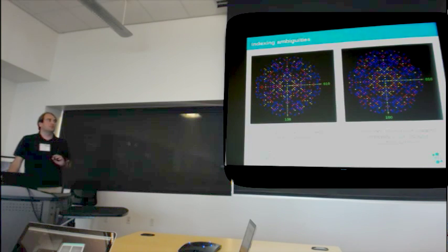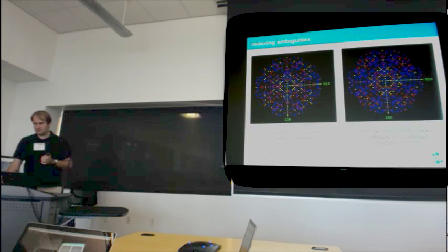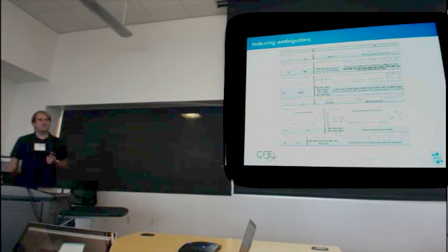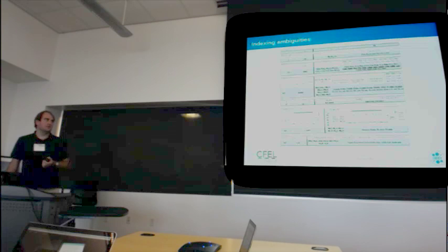If you put this into a normal program, what it will tell you is that the crystal is twinned. The crystal is not really twinned. It's an artifact. Now, Wolfgang Brehm very soon will be telling you all about this, which we showed in detail. In CrystFEL or on the website, there's a table that you can look up your favorite space group. It will tell you whether it's subject to this ambiguity. So it's a useful quick reference.